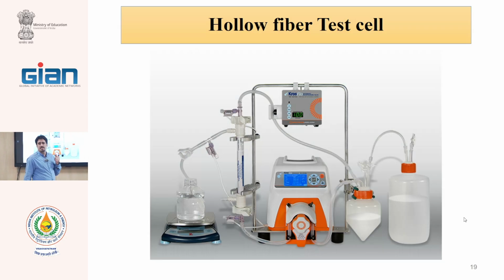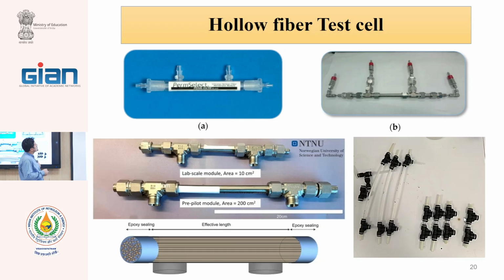For the hollow fiber test, the process is similar. In the hollow fiber test, we can also test as dead end and as cross flow. We have this usual setup for hollow fibers, you see, such as this also. We can prepare from stainless or from plastic tubes.